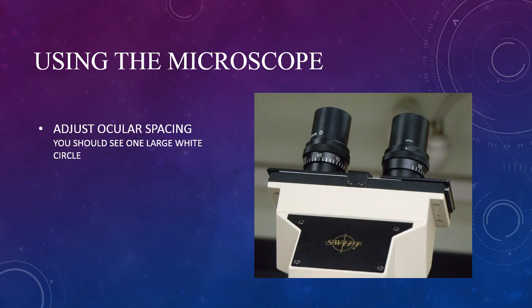Everyone's eyes are different. The spacing between them is different, and every eye itself has a different acuity. Binocular microscopes are designed to compensate for all of this. The first step is to get the ocular spacing correct. You should see one large white circle in the center. If you see two overlapping circles, you need to adjust the oculars in or out.